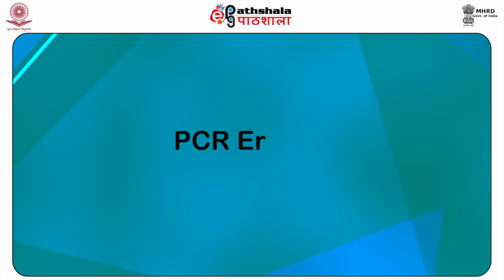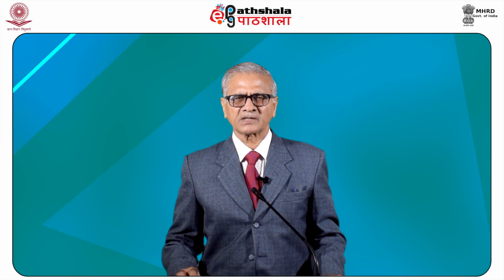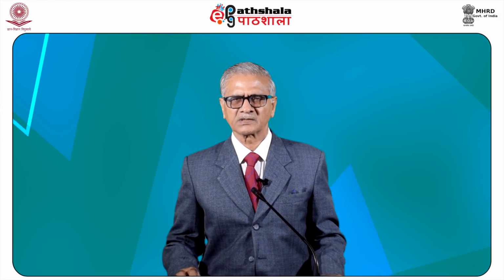Now, what are PCR errors? What errors take place while carrying out PCR? Polymerase chain reaction is not always free from errors. There are many factors which cause errors and inaccuracies in PCR products.